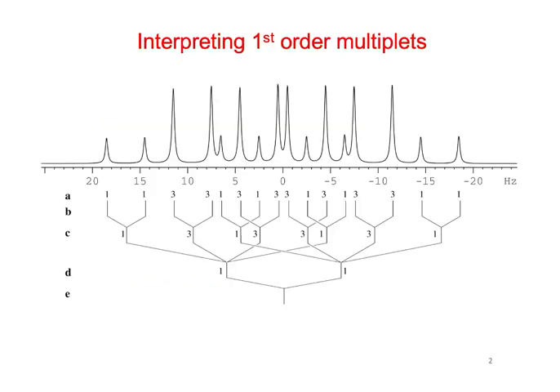Looking at a first order splitting pattern. This one has a splitting tree on it already, but if we were looking at this in the absence of that tree, what we would usually do, so notice that it's very symmetrical. So for one thing, that means it's first order, but the other thing is that if it is a single signal, it should be relatively symmetrical, and it's not like two overlapping signals or something like that.